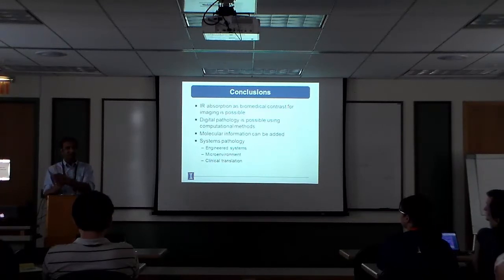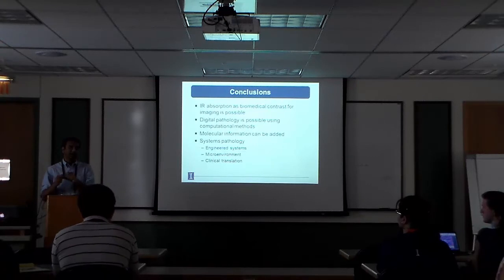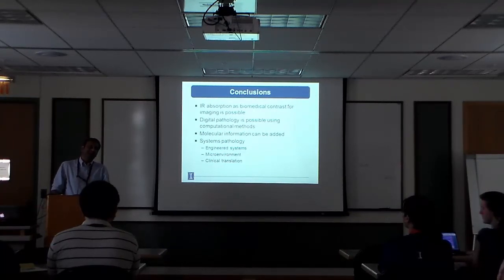You can do physics-directed or just regular deconvolution. It turns out that you're going to turn everything into a smooth surface if you do that anyway. And so the value of that is, again, questionable at that point. But just purely, do you get more information by changing hardware? The question is, till 1 micron you do, and then you don't beyond a micron. So you can't get 100 nanometer resolution just by hardware. Even if you made the pixel size 100 nanometer, you're not going to get anything.